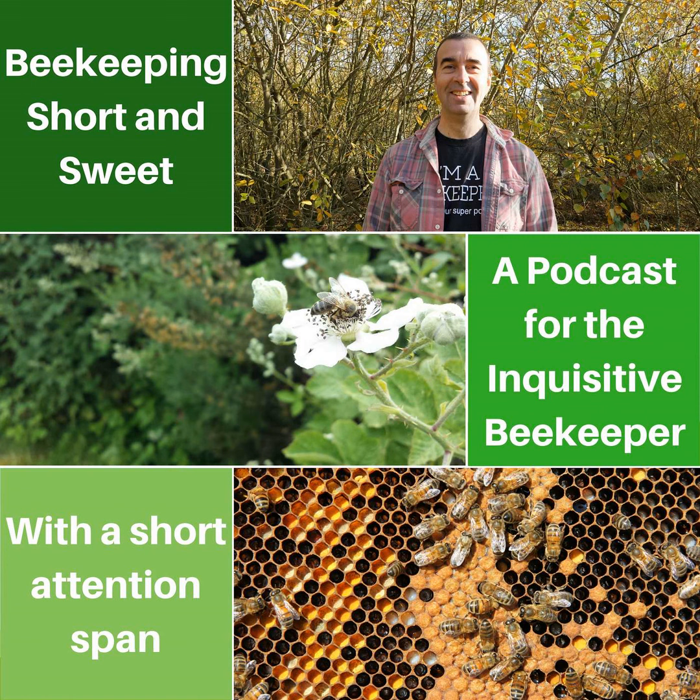For a beginner beekeeper, or even an advanced beekeeper who would like to get into microscopy and just start the process of learning how to use a microscope, could you just explain maybe a standard kit, including microscopes, that they would need that would allow them to get started in microscopy?